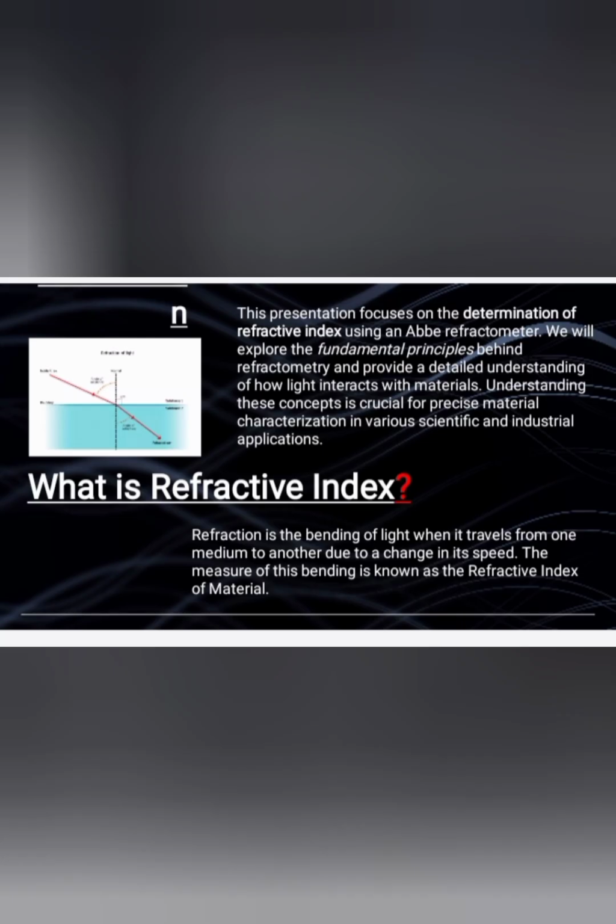Introduction. This presentation focuses on the determination of refractive index using an Abbe's refractometer. We will explore the fundamental principle behind refractometry and provide a detailed understanding of how light interacts with materials. Understanding this concept is crucial for precise material characterization in various scientific and industrial applications.